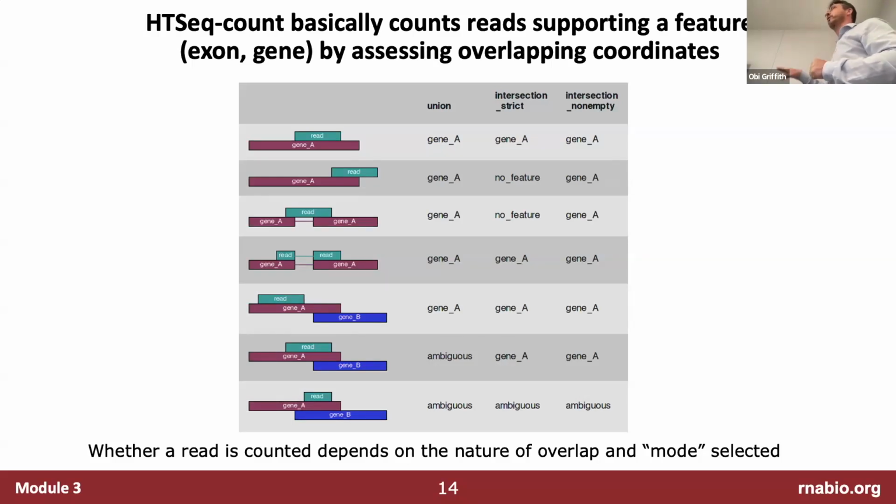And that's why we're doing both. We're going to go through both paths. So you're going to get this transcript level delineation, but also the gene level. And there are advantages and disadvantages to both. And that would be a major difference that you just highlighted.